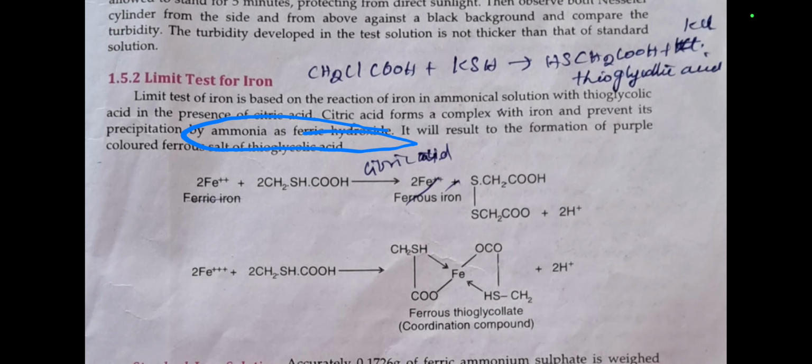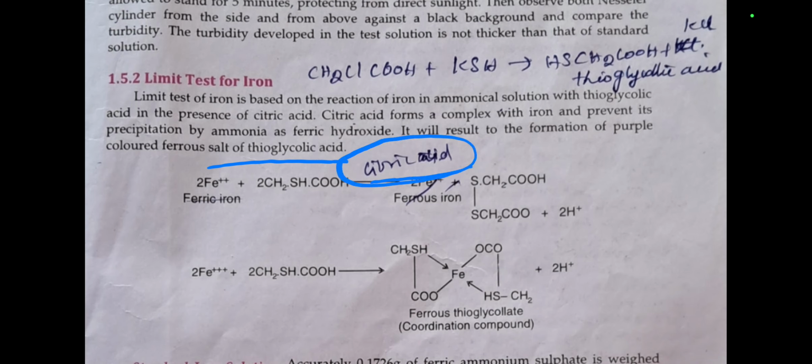So the iron is retained in the ferrous form, which results in the formation of the purple colored ferrous salt of thioglycolic acid. So this is the main function of citric acid: it doesn't allow the iron to be converted by ammonia into ferric hydroxide precipitate, so the solution retains the iron in the ferrous form.